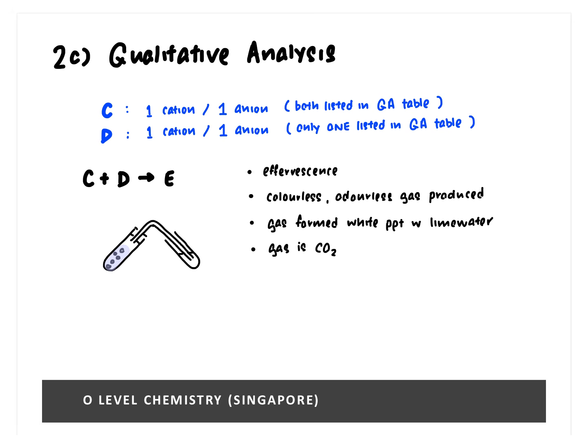Okay, so if you were to anticipate carbon dioxide being produced, you have to prepare your lime water and delivery tube in advance. Okay, and almost immediately after adding D, you should cap the test tube with your stopper. All right, and you should rock the test tube back and forth to push the carbon dioxide into the lime water, which I think many of y'all did not react in time. So if you wait 1 or 2 seconds, the carbon dioxide will be all gone.